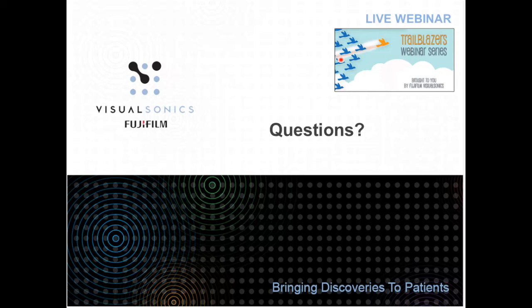Yeah, there are several considerations here. The spectra may change because of the change in fluence at depth. It may also change because of the contrast agent that you're using itself.